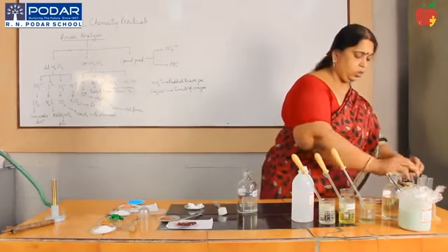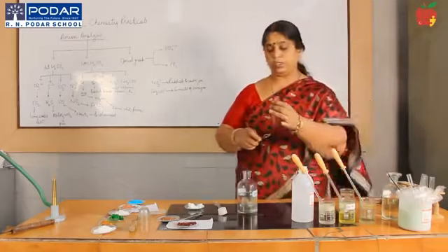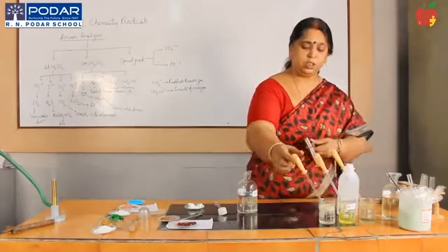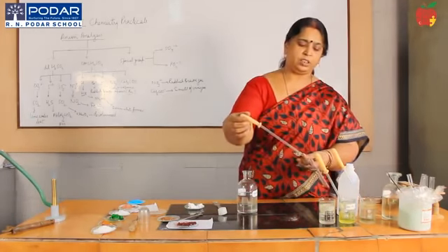Use your test tube holder always when you are using concentrated acids. Never forget to use that. Okay, so always when you are using concentrated acids, please do use the test tube holder. Just add a drop of concentrated sulfuric acid.